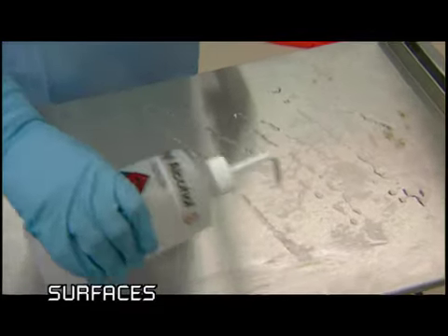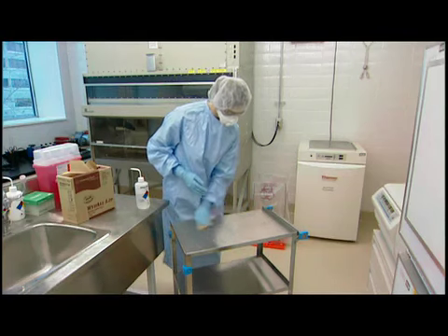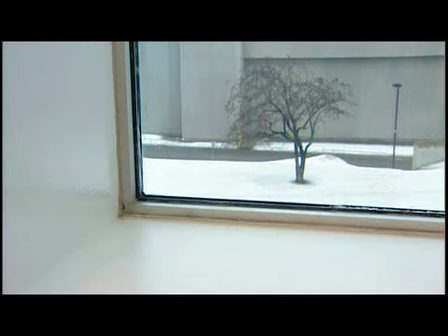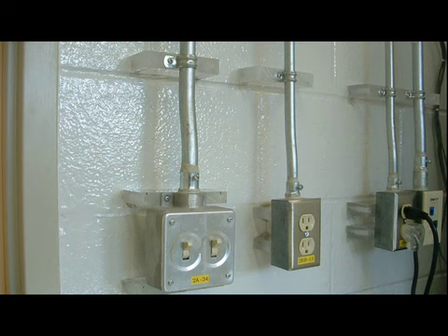Bench tops and working surfaces should be made of non-absorptive, non-organic material with no open seams. They should have rounded edges that are easy to clean. A cove from floor to wall is a good idea, but what's most important is that the seams where walls and floor meet be continuous. One last thing, all coatings must be cleanable and must be able to withstand chemical disinfection and fumigation.